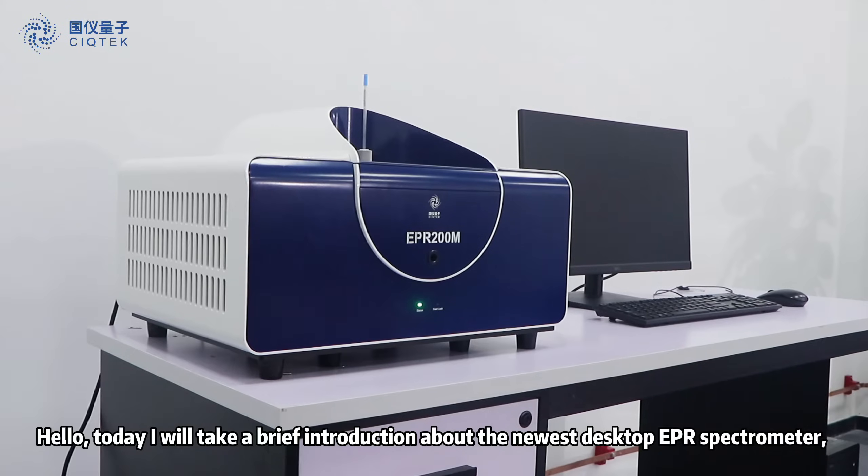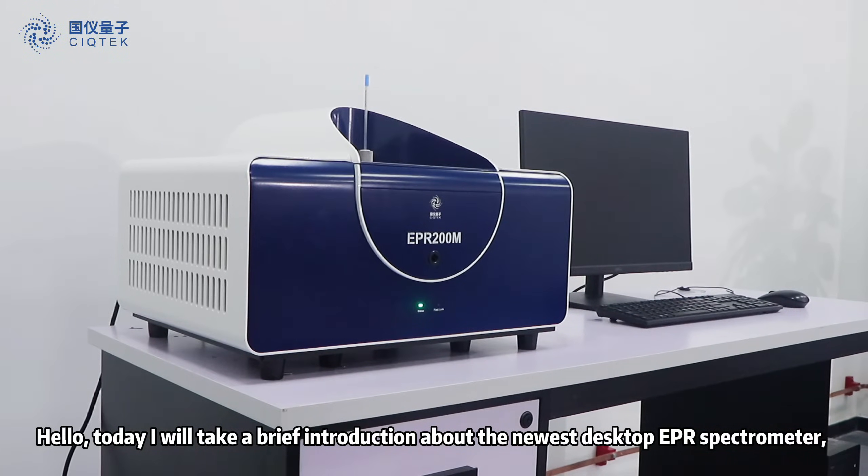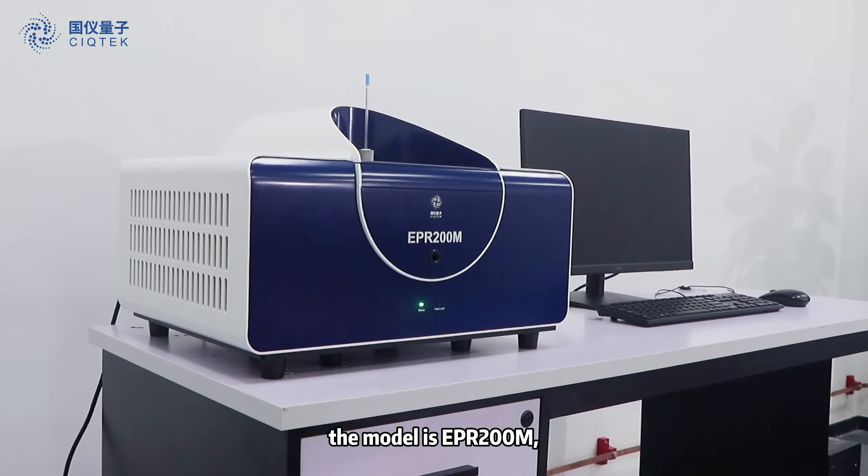Hello, today I will give a brief introduction about the newest desktop EPR spectrometer. The model is EPR200M.